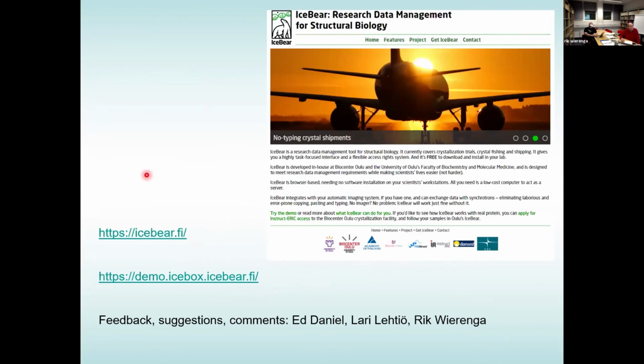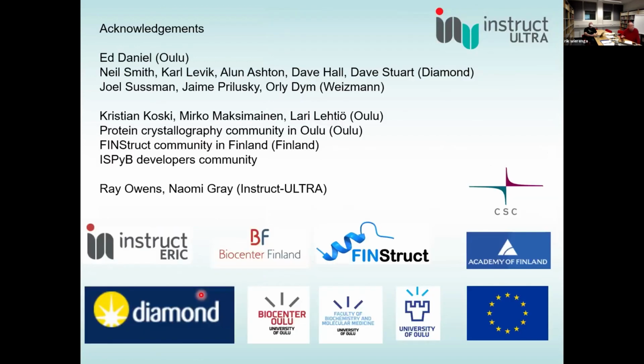Ed has made a project website which you can find easily, and on the project website there is a link to the demonstration server. If you play with the software, please let us know feedback and suggestions for how we can improve it. This demonstration server is reset every day at the end of the day, so the database is always fresh the next morning. So you can change the database without any additional trouble.